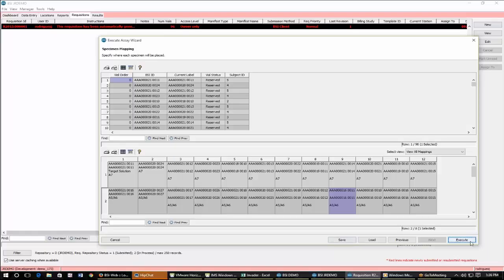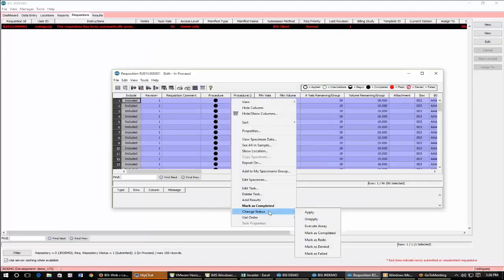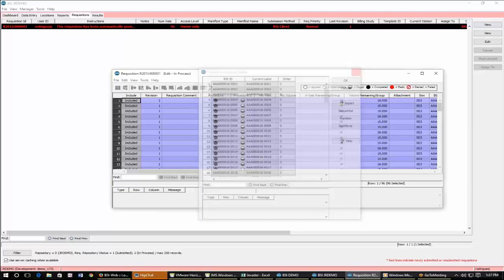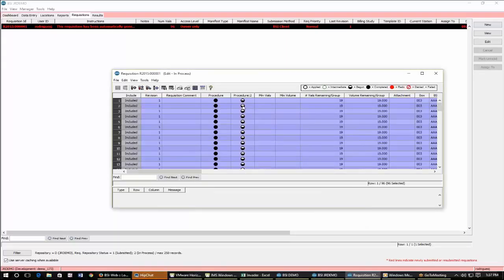Yeah. Can you edit that vial order from there? From here, no. Where do you enter the vial order? From the task. Oh, okay. Yeah, and you could scan it, or I guess you can't scan here. You could import here. And that would carry over. Yeah. Okay. Yep.